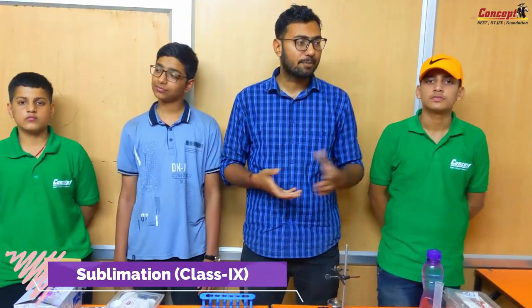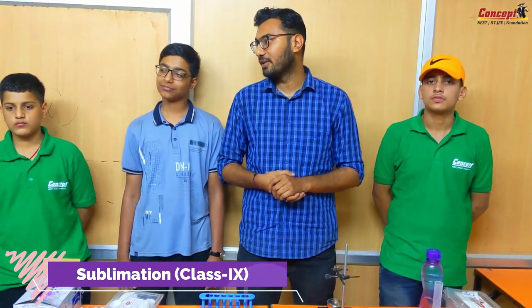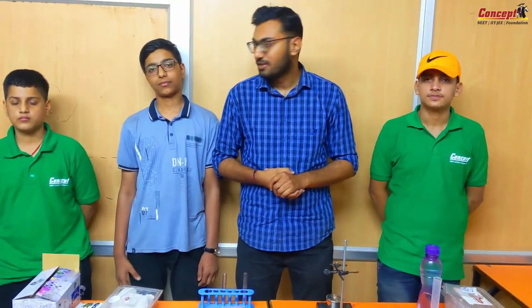Today in this experiment, we are trying to perform sublimation of ammonium chloride. What happens when we heat solid ammonium chloride? Would you like to see it? Everyone wants to see it, right?